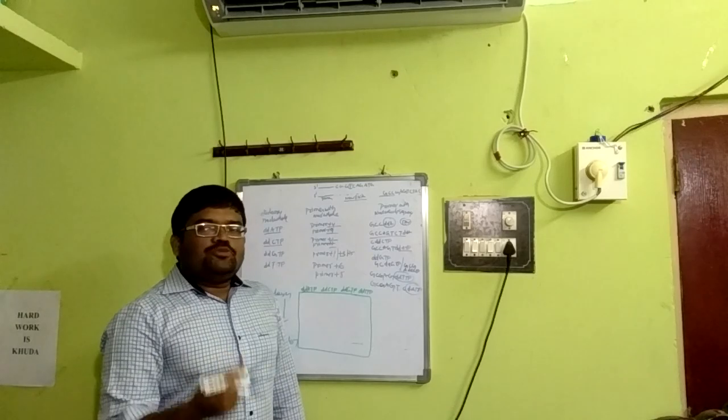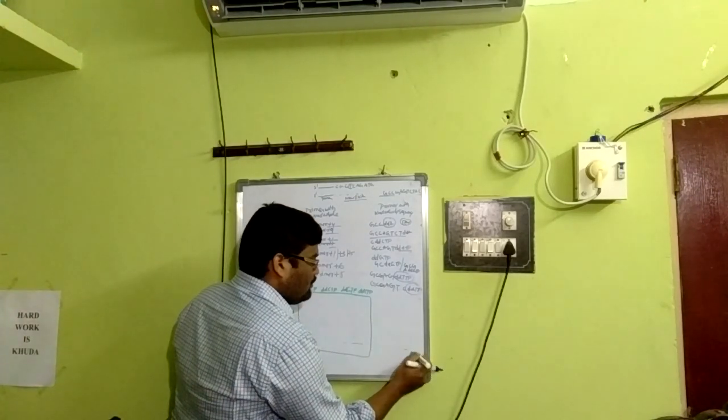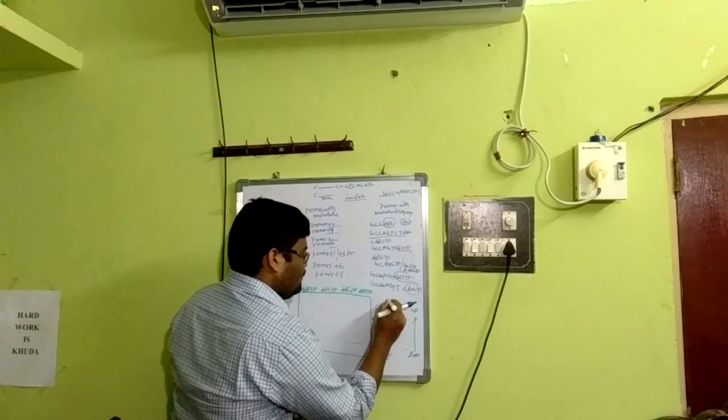Conventionally, the bands should be read from bottom to up, from bottom to up, that is 5' to 3'.